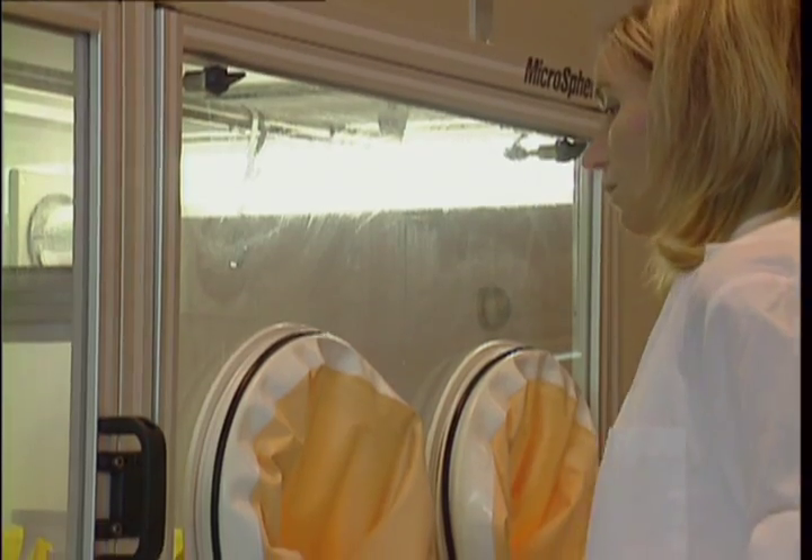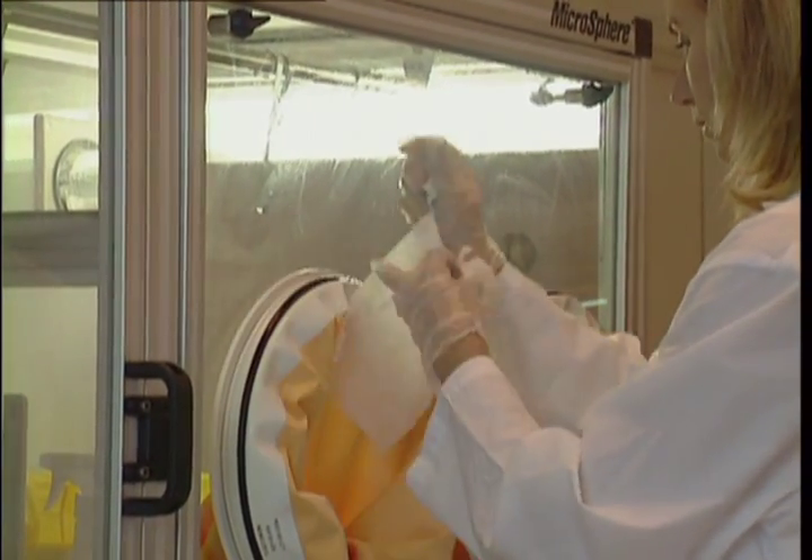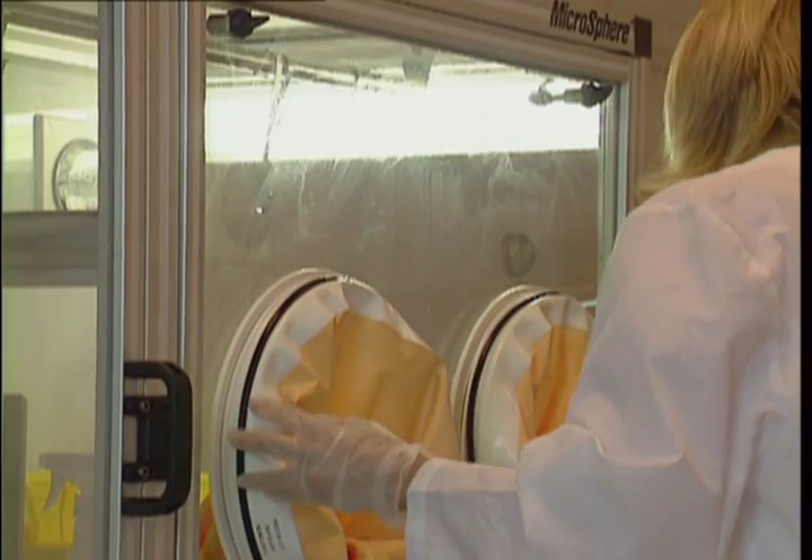Clean the external surface of the front glove port window. Upon cleaning, decontaminate the unit.